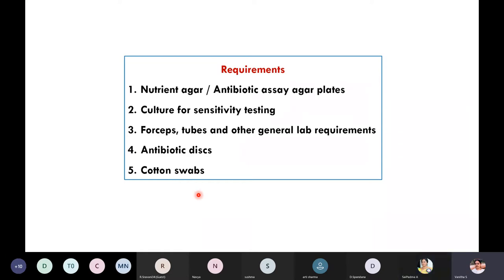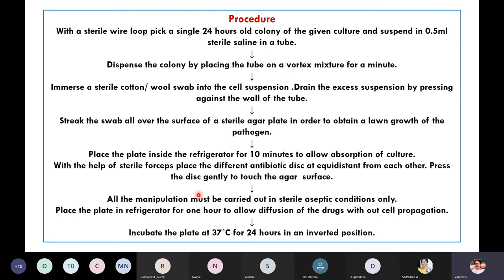Cotton swabs are required for preparing the culture on the plate. For the procedure, first with a sterile wire loop, pick up a 24-hour single colony of a given culture and suspend it into 0.5 ml of sterile saline in a test tube. Take the test pathogen or culture on which you want to determine the effect of the antibiotic, prepare a 24-hour culture, pick up a colony, and put it into the sterile saline solution.